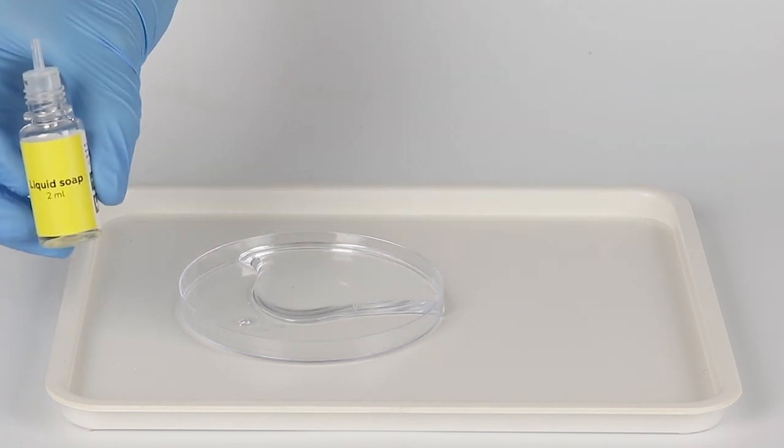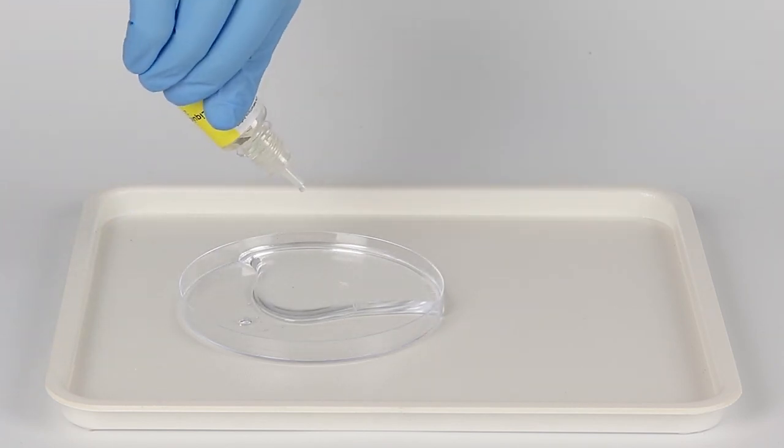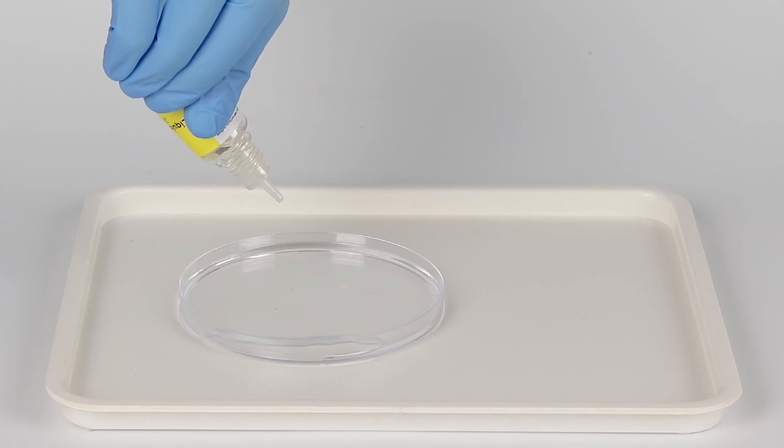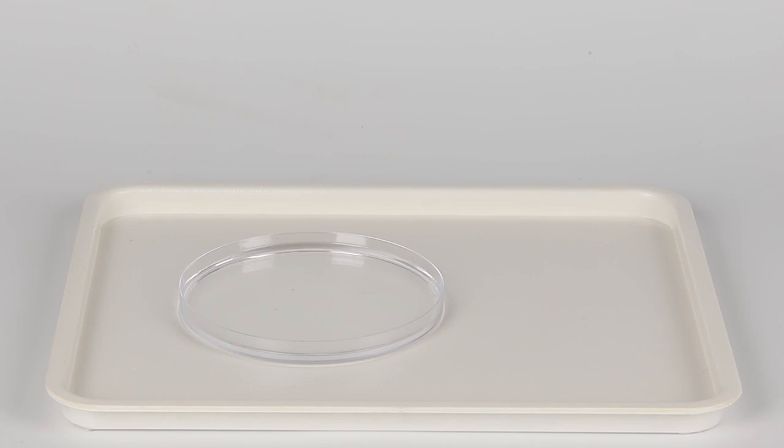Add two droplets of liquid soap to make the liquid spread evenly across the bottom of the petri dish. When liquid soap is added, it reduces the surface tension of the solution. In other words, it acts as a surface active agent, causing the solution to spread.